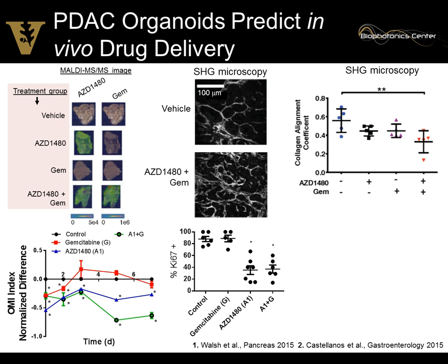So what we're doing with this treatment to the fibroblasts is decreasing their proliferation, especially with the JAK inhibitor, but we're not killing the fibroblasts. So in that way, I hypothesize, I'm not sure, but I think that this is why we're not seeing changes in collagen density, but we're seeing changes in the organization of the collagen.